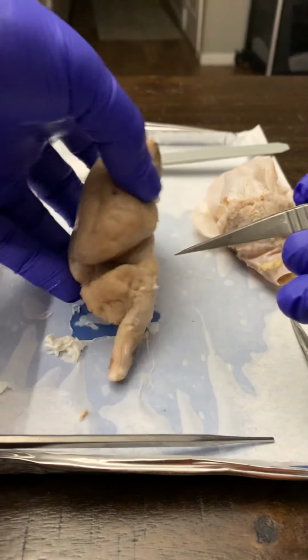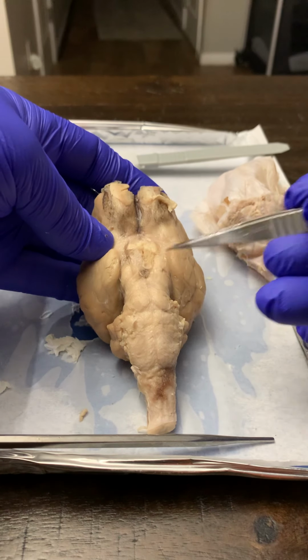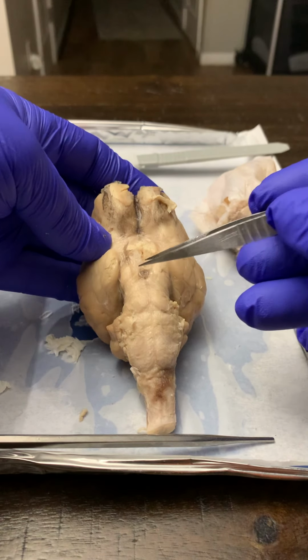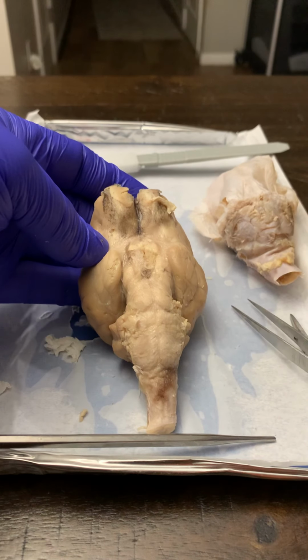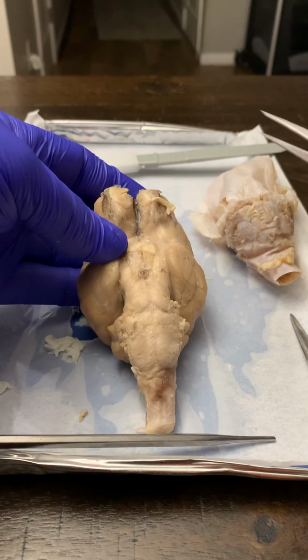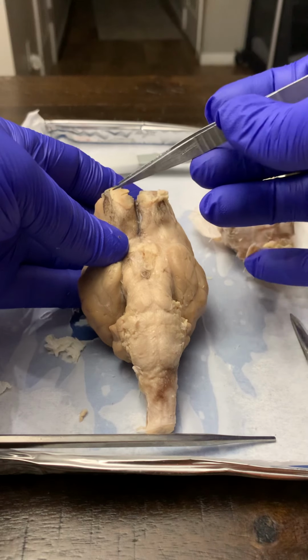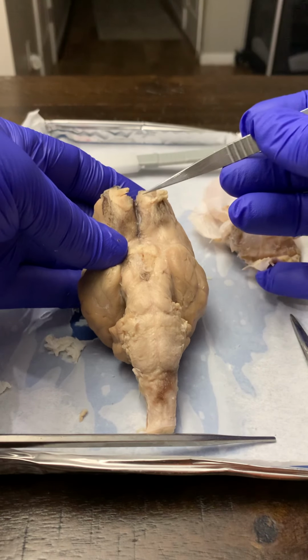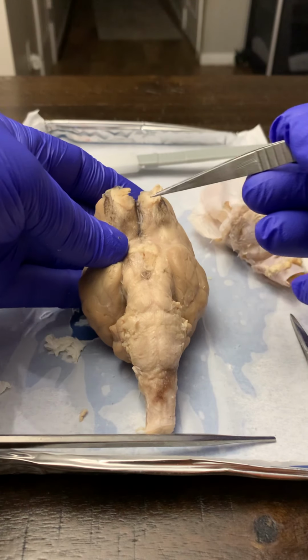The pituitary gland is going to be right here, that little dark spot. I dissected through it, so that's going to be your pituitary gland. For your cranial nerves, starting with cranial nerve 1, olfactory, you have the olfactory bulbs, which are going to be these big things here up top, and then the nerves are going to track back deeper into the brain.